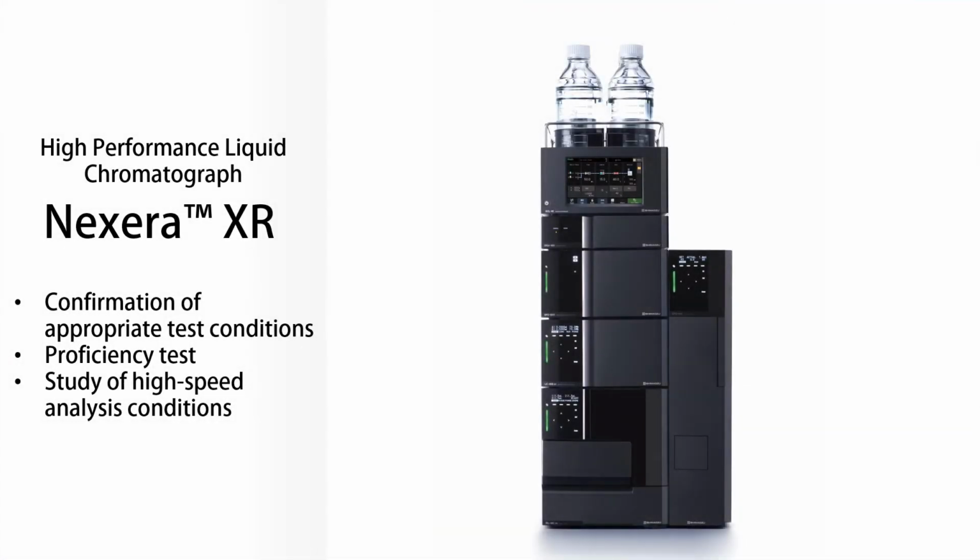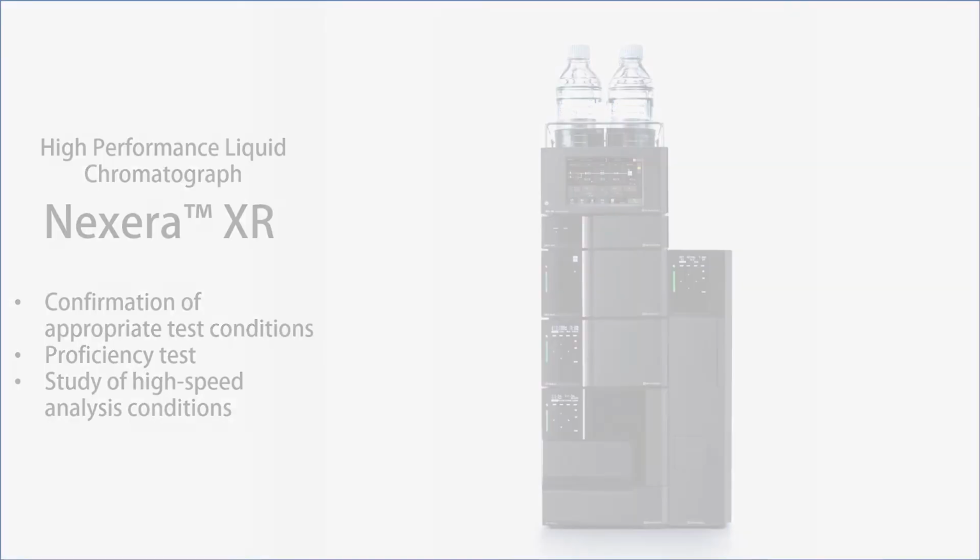In the skin sensitization evaluation, there are set testing conditions, for example the linearity of the standard calibration curve and the system stability check using a reference control. A proficiency test is also provided to assess the test environment and the technical proficiency of the tester. We use the Nexera XR to perform these evaluations for this application news. High-speed analysis conditions were also evaluated.